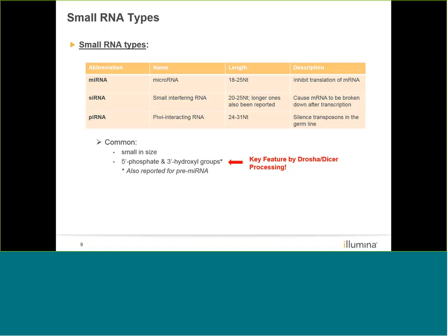So you might wonder, Illumina has a couple different kits for mRNA and total RNA sequencing. Why do you have a separate kit for small RNA sequencing? That's just because small RNAs, by definition, they're very small. They're too short to be captured by the regular mRNA and total RNA kits. That's why we have a separate kit for small RNA. And we'll talk about how we capture the small RNA in the future slides.